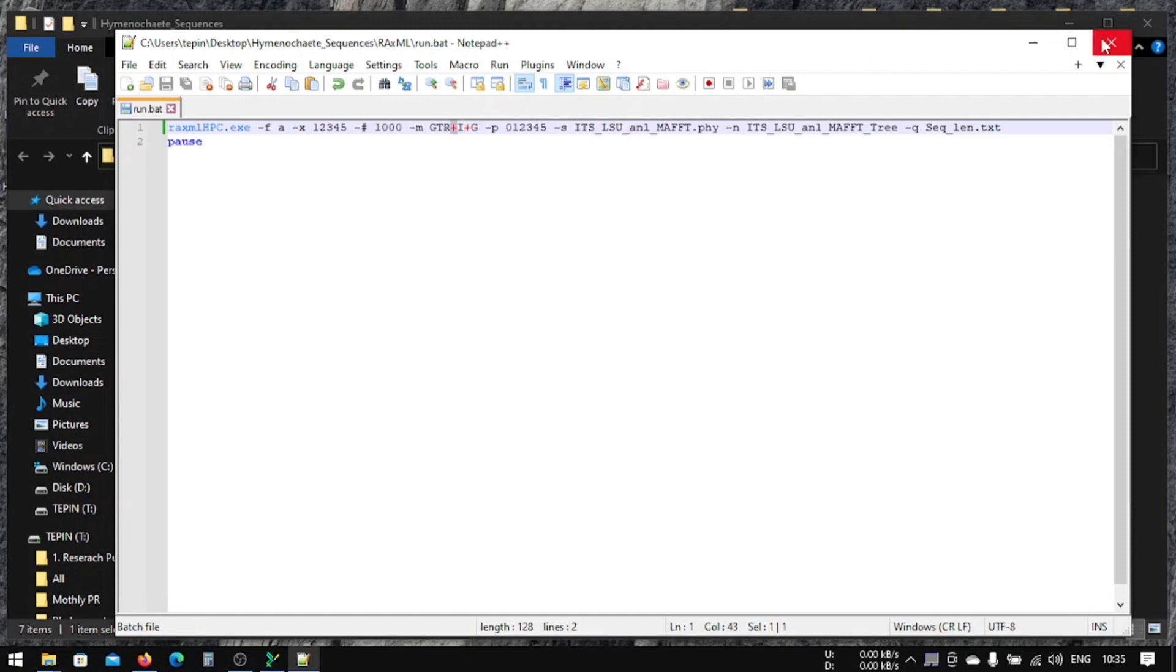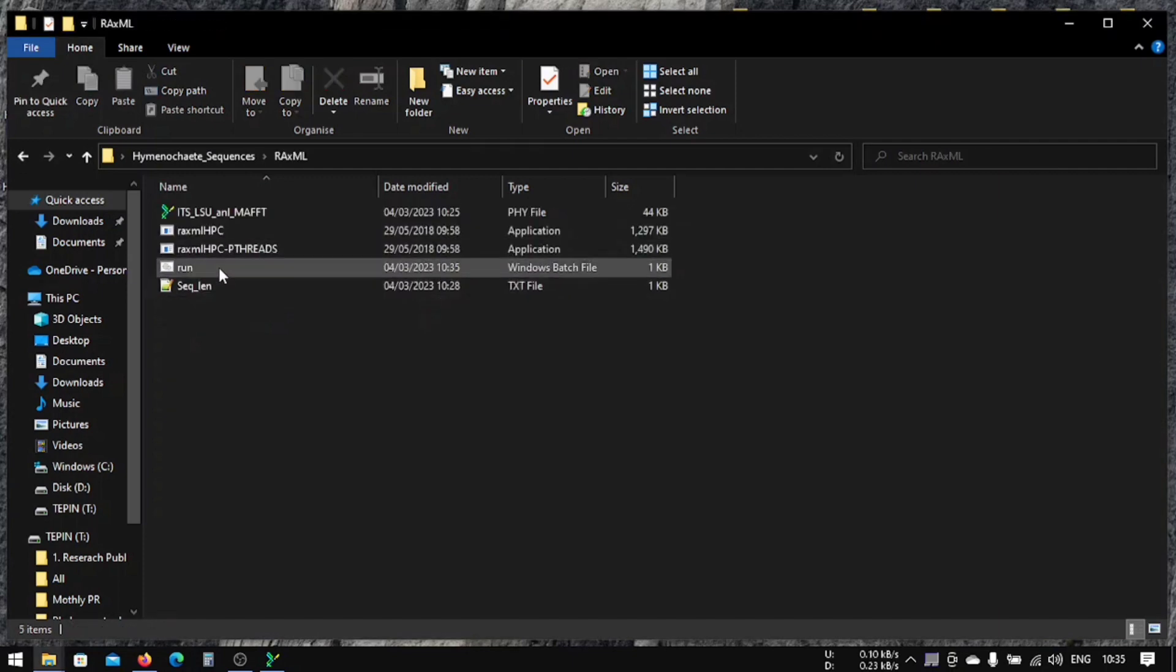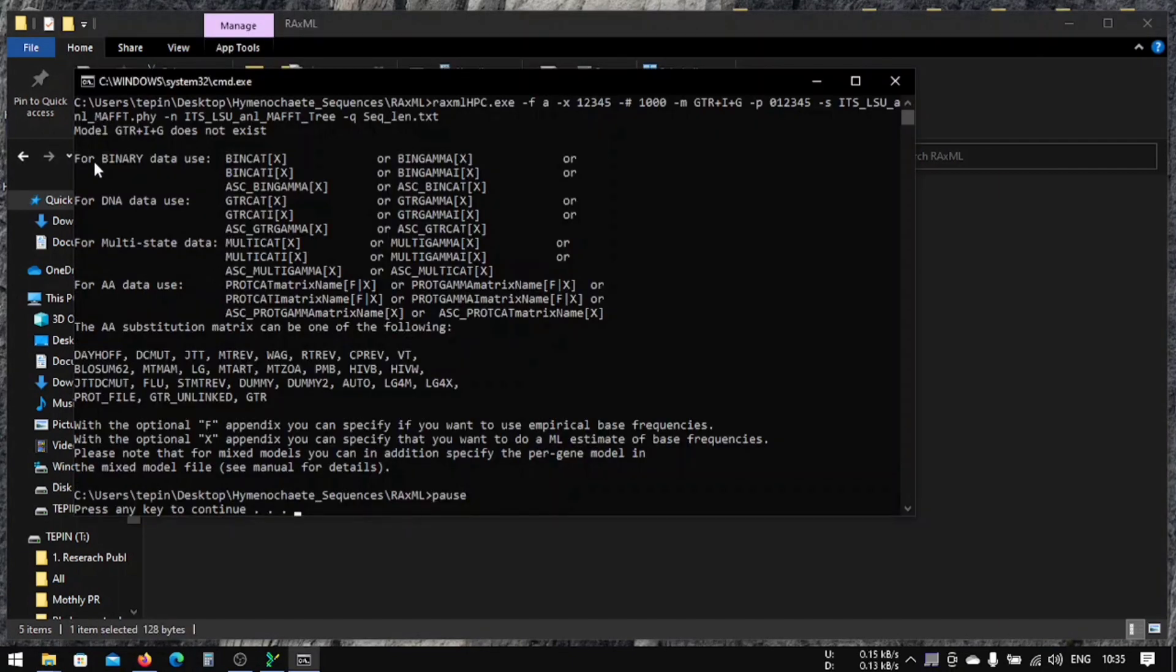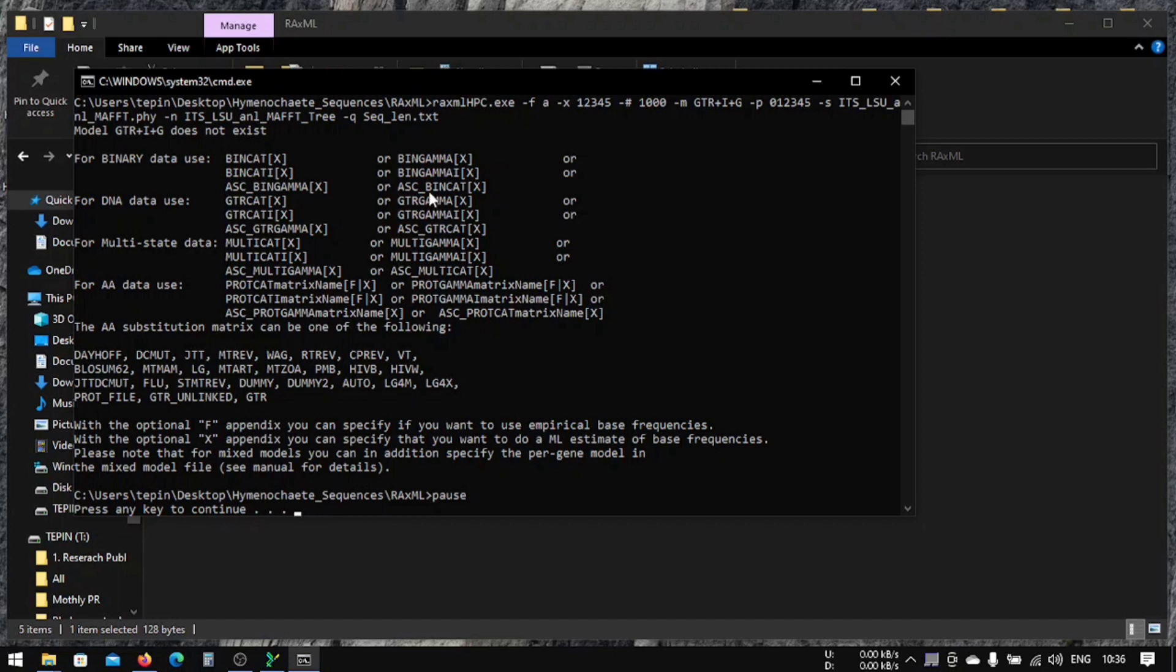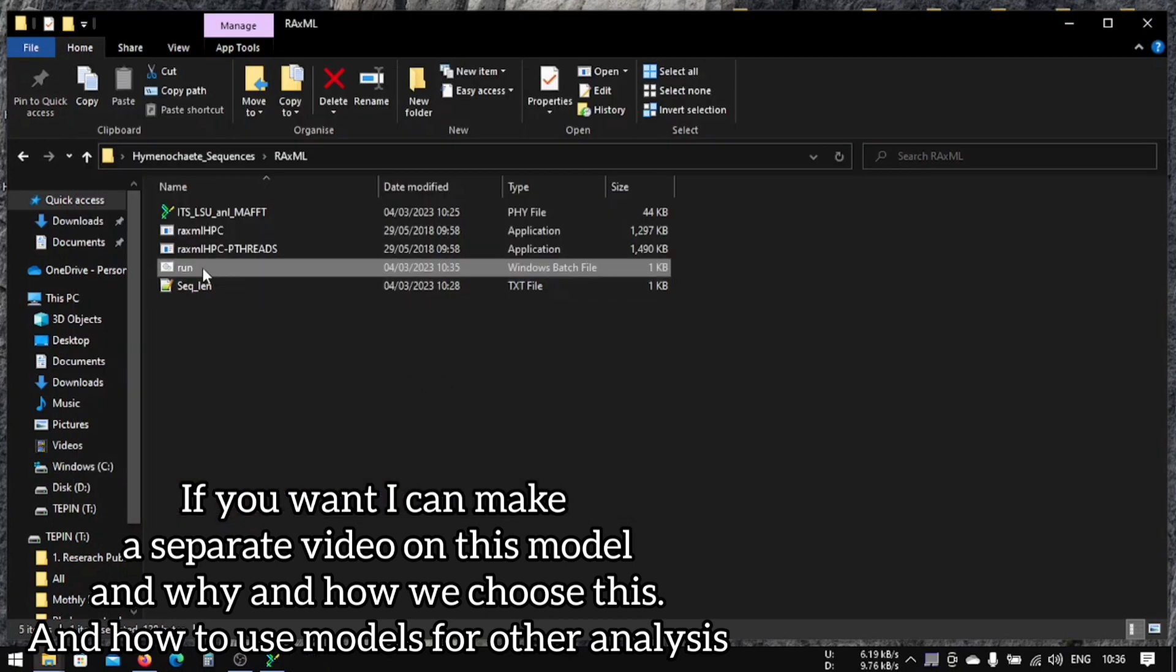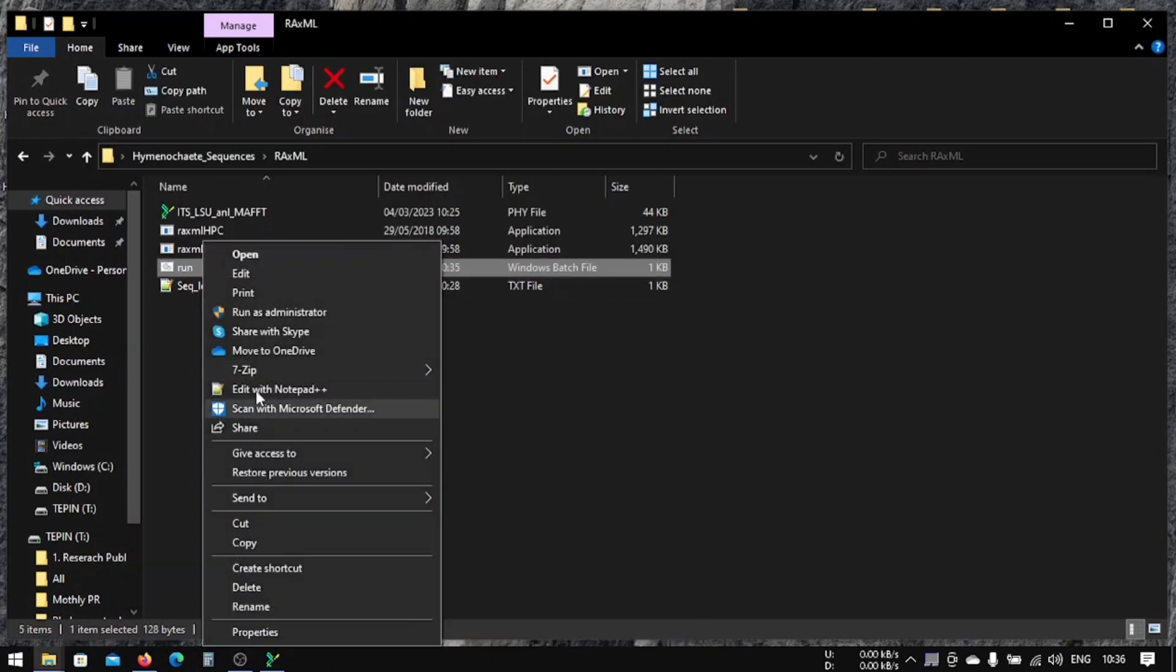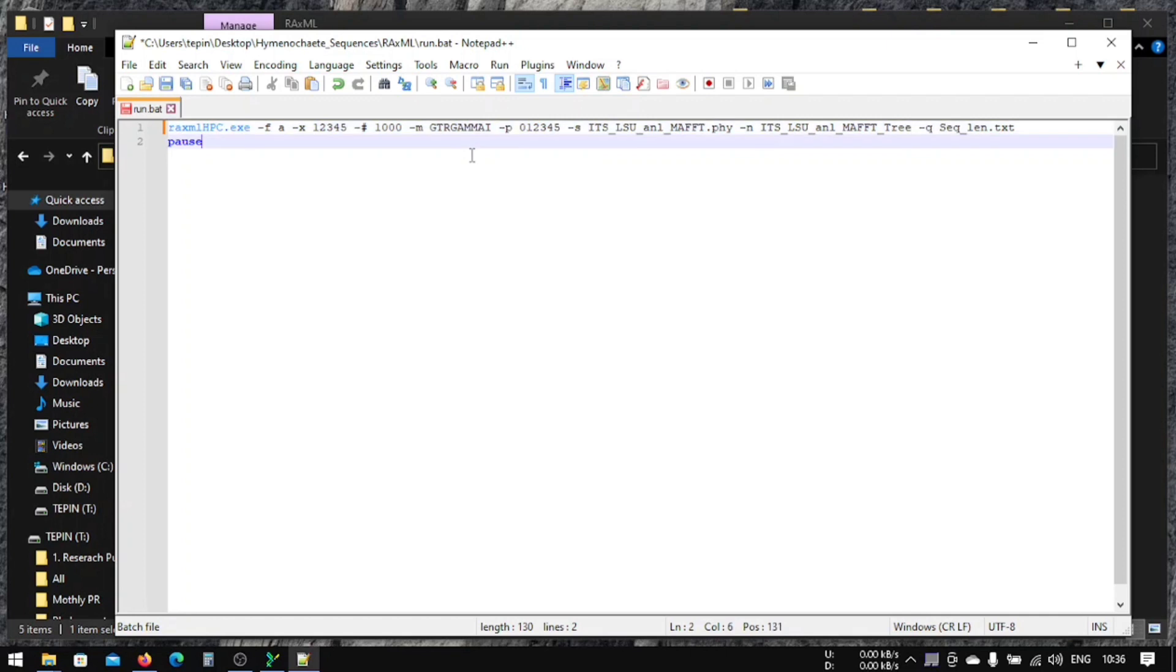Let me show you what happened when we run this. If you run this, it says binary data use, for DNA we can either select GTR CAT, GTR GAMMA, or GTR analysis, and GTR CAT I or GTR GAMMA I for other analysis. And that's it. So we are supposed to use GTR GAMMA I, because this is our model. Now we have added this. In case of GTR IG, usually this code is used, so that's why we're using this. We'll save this.